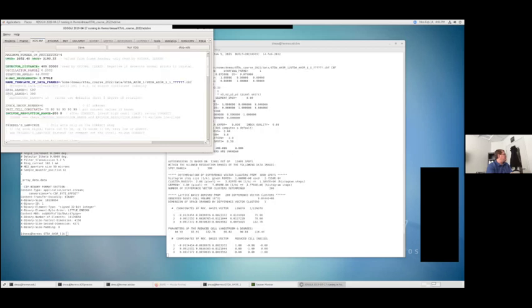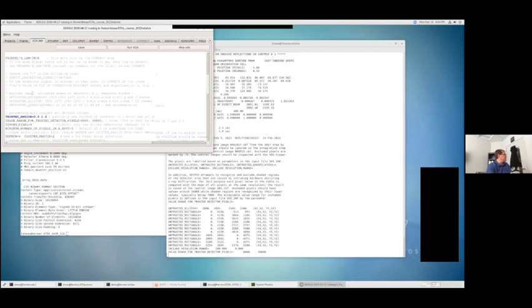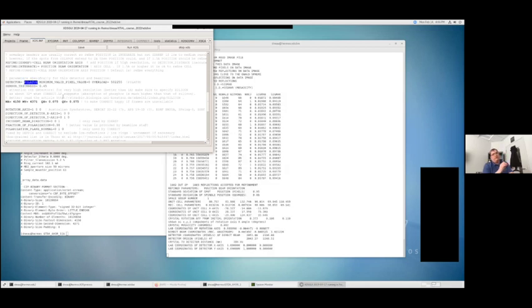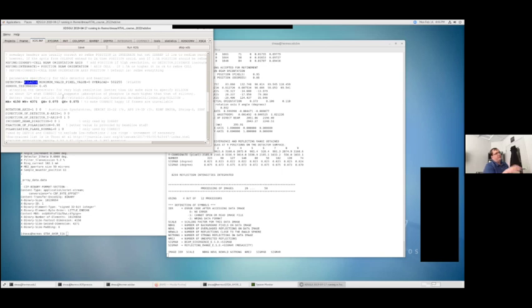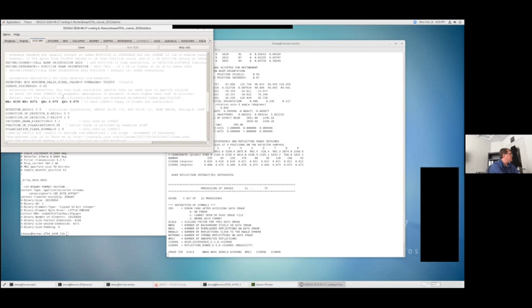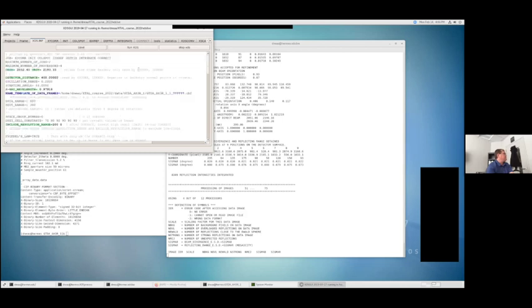One thing I did forget to mention is that in the input file, it will say what it thinks the detector is. So in this case, it thinks it's a Pilatus because we're looking at .cbf files, but in actuality, this detector is an Eiger. The fact that it says it's a Pilatus actually doesn't make a difference as far as processing, I don't think anyways, but you can come in here and correct it to Eiger and make sure that's correct.